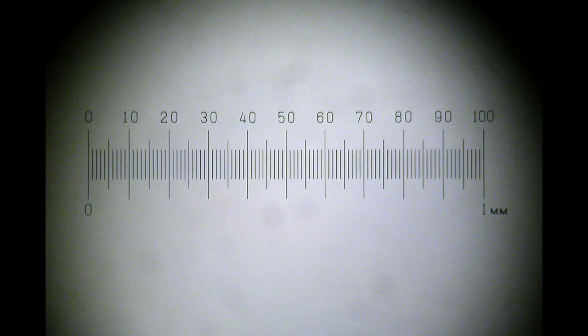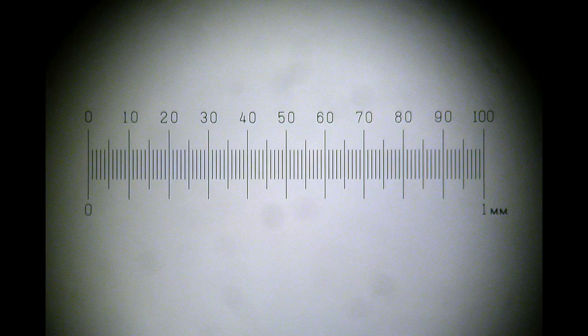Using the 10x objective, which remember translates to 100x magnification, you can see that this is an accurate 1mm scale etched into the glass of the slide and is identified by the 1mm label bottom right.